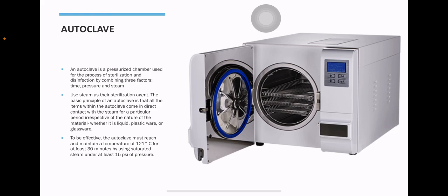Next, we have your autoclave. It is the heart of sterilization. It uses steam and pressure and time to kill even bacterial spores. So the gold standard parameters are 121 degrees Celsius, 15 pounds per square inch, or 15 psi, as well as 30 minutes if for decontamination.